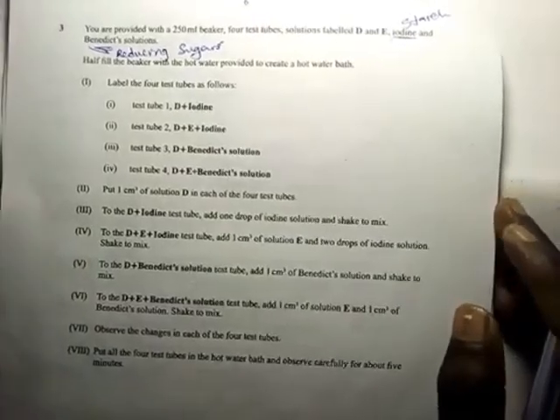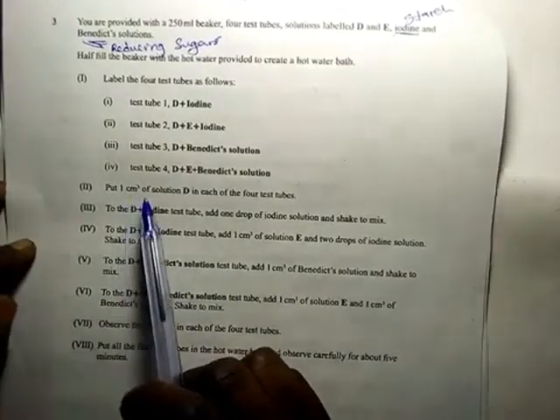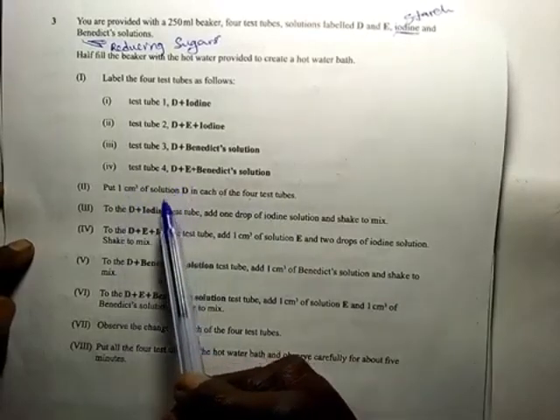In 2, they are saying put 1 centimeter cubed of solution D in each of the 4 test tubes. This also means 1 milliliter.